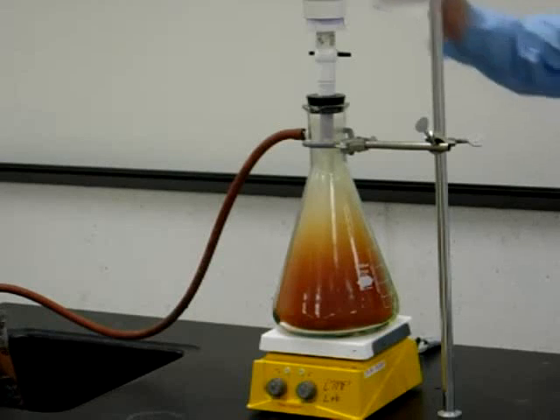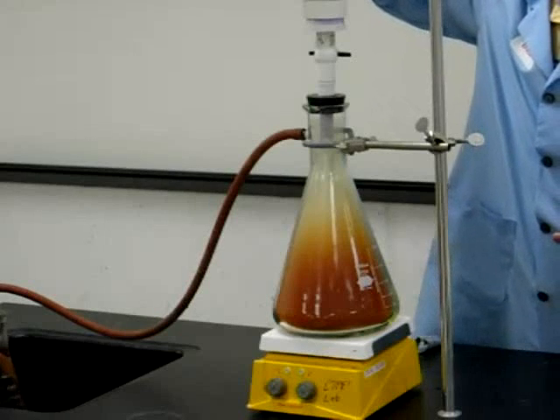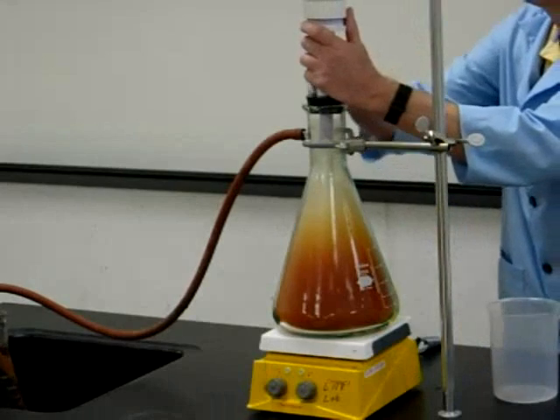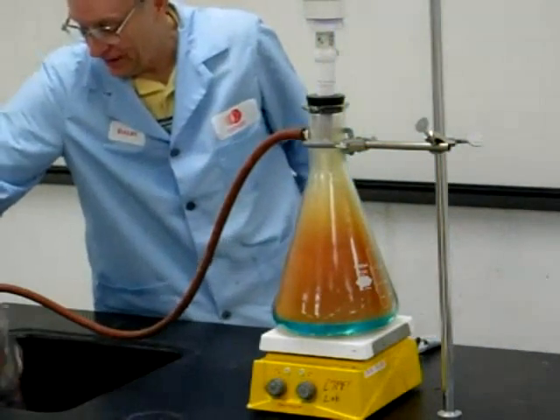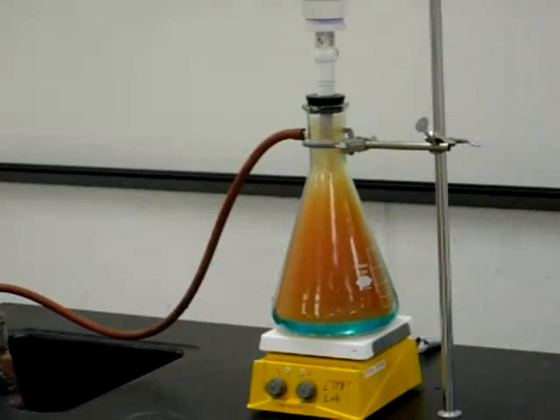To stop the reaction, I'm going to add water to the flask, and fully initiate the aspirator to remove the reddish-brown gas from the flask. The reddish-brown gas is nitrogen dioxide and is a toxic gas.